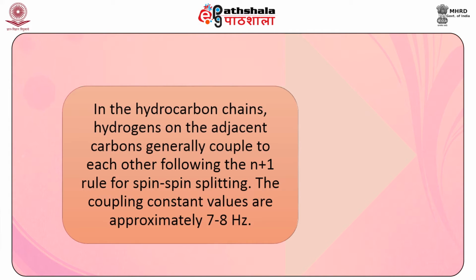Now, in the hydrocarbon chains, hydrogens on the adjacent carbon generally couple with each other following the n+1 rule for spin-spin splitting. The coupling constant values for this will be approximately 7 to 8 Hertz.